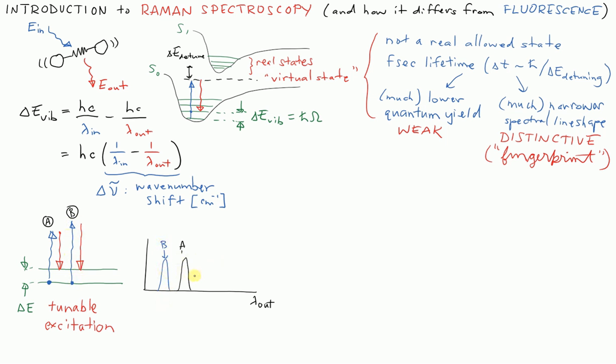Again, what I want to emphasize is that the spectrum shifts with excitation wavelength for Raman. The spectrum does not shift with excitation wavelength very much for fluorescence.